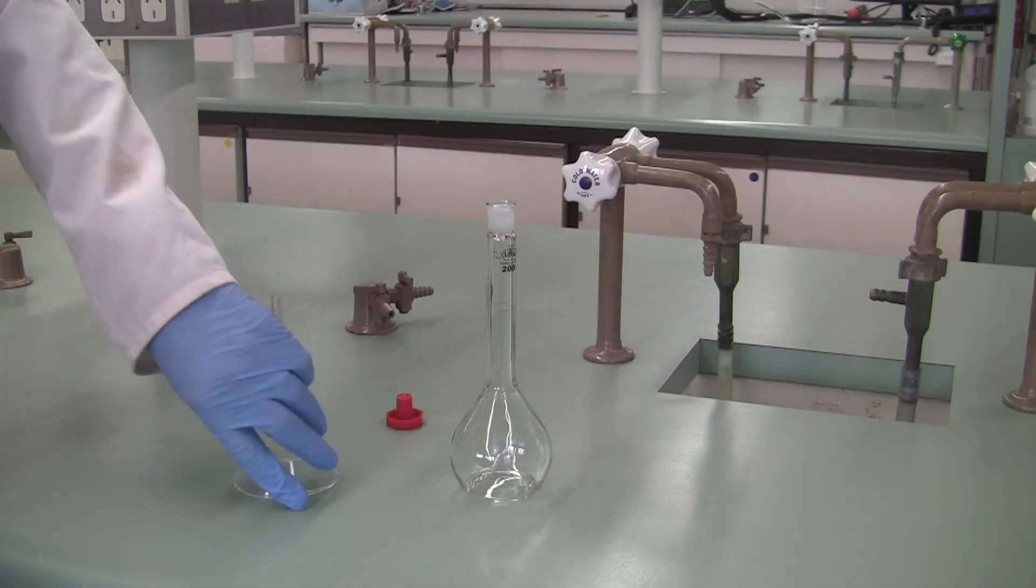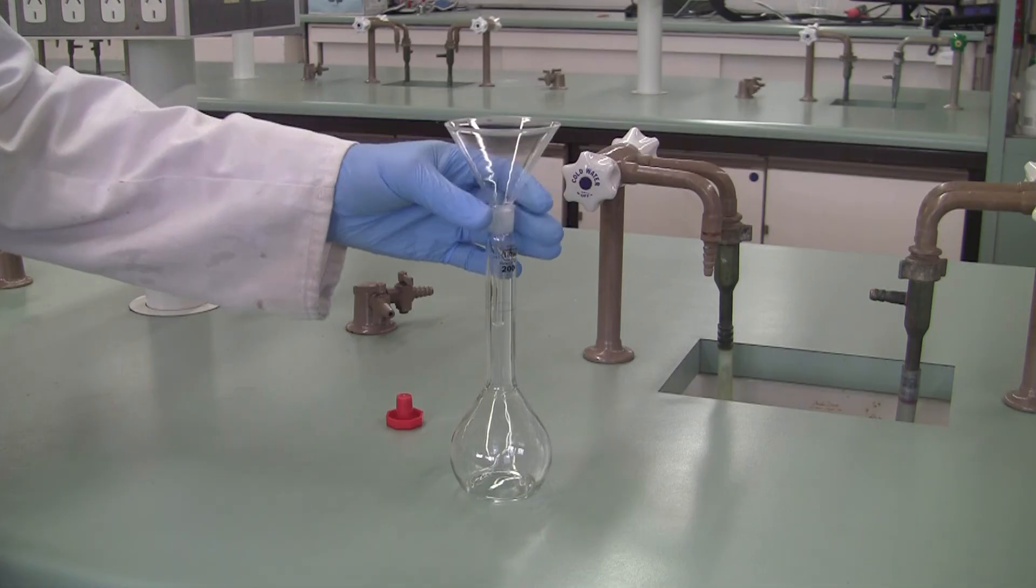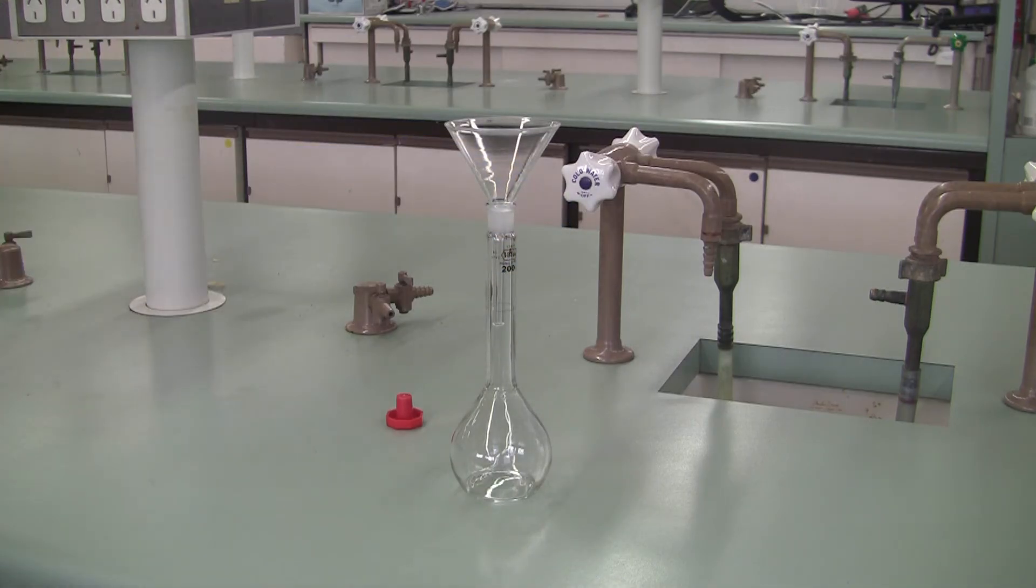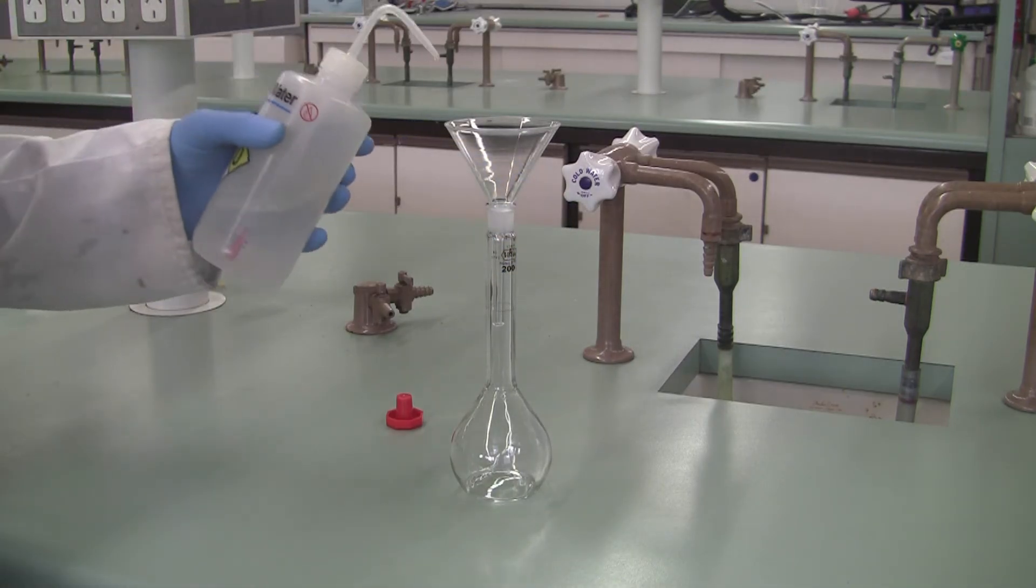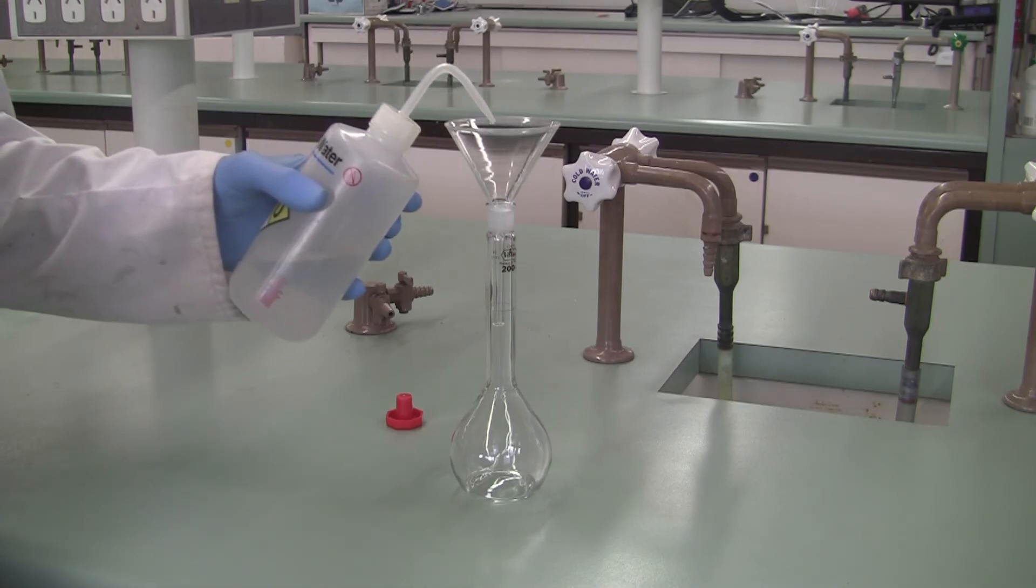If you need to transfer the mass into a standard flask or something with a narrower neck, you can use a glass funnel. Afterwards, use your wash bottle or solvent to rinse all the solid into the flask.